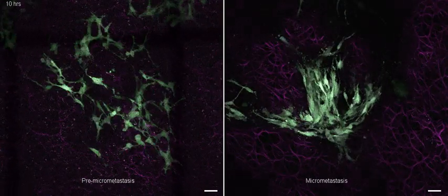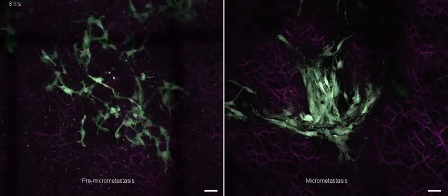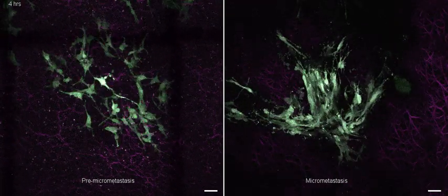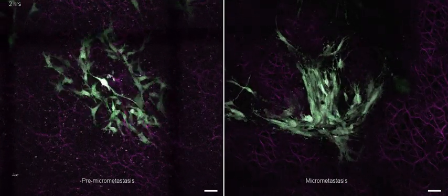On the left-hand side, you see that the cells within the pre-micrometastasis are very motile. They move around a lot. On the right-hand side, the cells are just sitting there and are not motile.